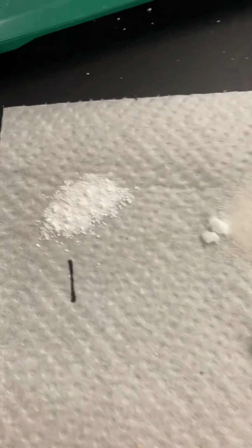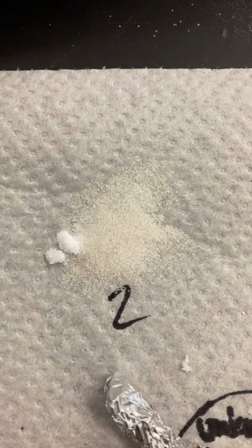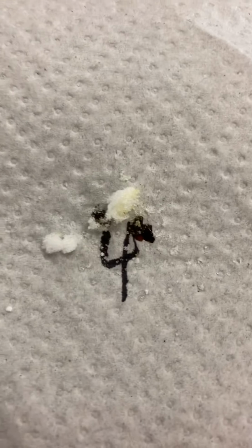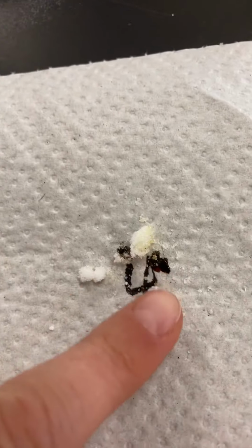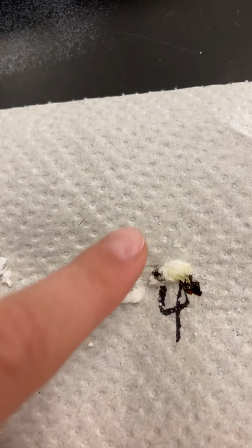Okay, substance 1 remained unchanged. It had no melting whatsoever. Substance 2, you guys can see that it turned kind of an off color. It's no longer white. Substance 3 did a little bit of melting, enough to clump it together, but not to completely liquefy it. Substance 4, you guys can see where it had this black goo, and it started to melt here, and maybe I just didn't let it melt long enough, so we had a black goo there.